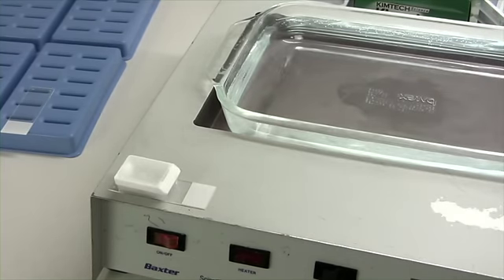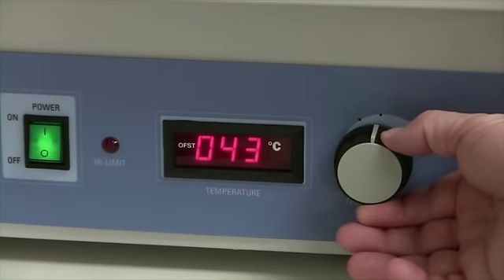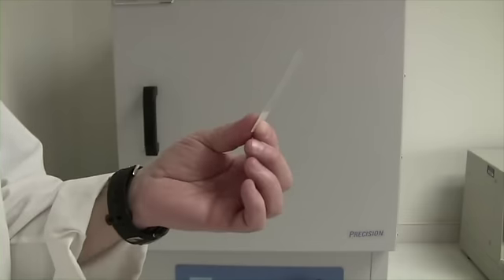Don't put your array block too close to the glass dish. This area is extremely hot and it will definitely melt your block. Please test this procedure with a blank paraffin block and a slide if you're going to use this technique. Make sure it works for you.